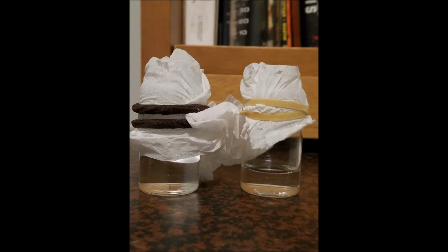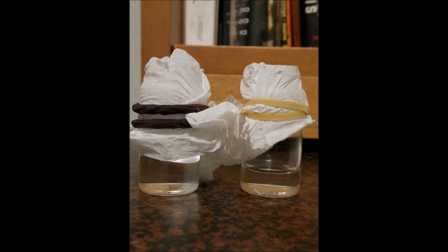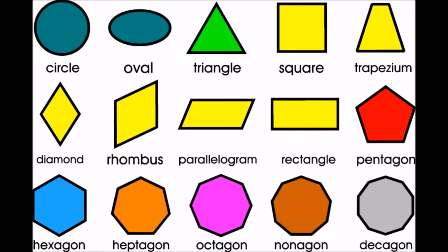Now, I know everyone's dying to know what our own personal crystals look like, so we'll show you a little picture. And, yeah. As you can see, there's literally nothing in either of these vials. Now, I know that the rubric wanted us to talk about the size and shape and number of the crystals, so the size is very, very small, can't even be seen by the human eye. Shape? Who knows? I can't see it. And number? 0? I mean, there's definitely some there, but 0 are visible.